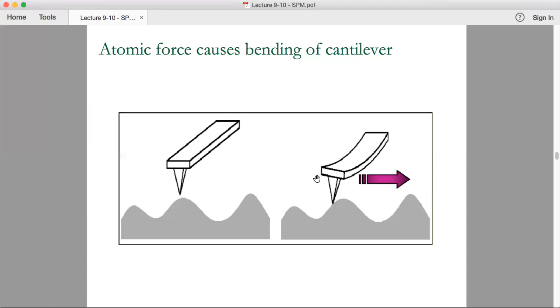So what happens here is that when you bring the cantilever tip closer to the sample, there will be van der Waals forces, magnetic forces, atomic forces, likewise so many forces that will mechanically tilt the tip. The tip position, in the original invention, was detected by another STM tip. But then in 1987, Wickramasinghe's group invented this light lever mechanism.